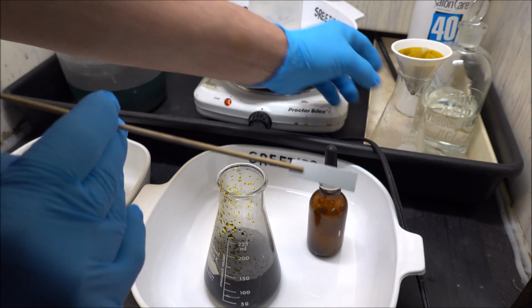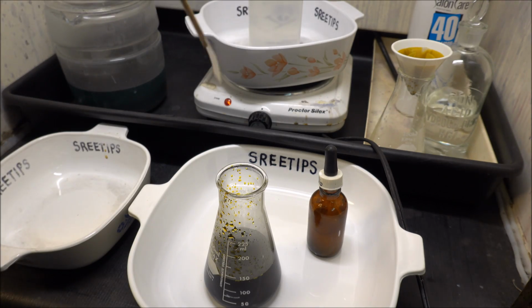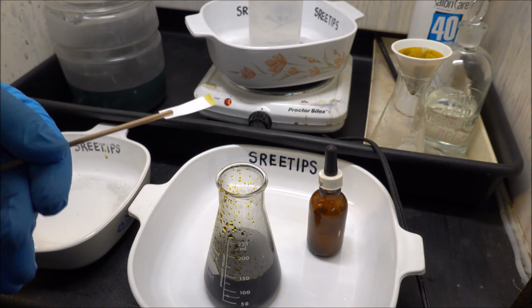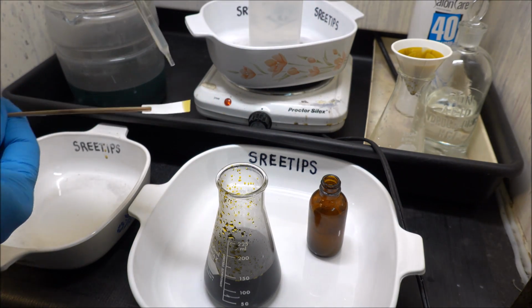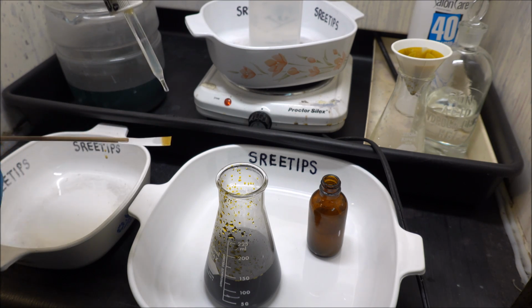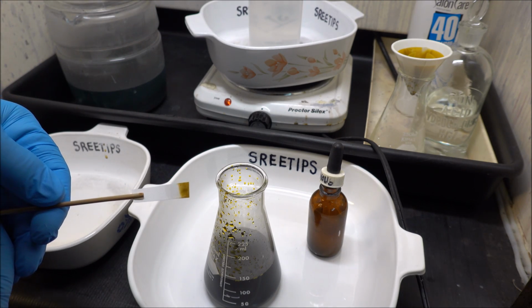And what I've got here is a piece of filter paper on the end of a bamboo skewer. Stick it down into our solution. Get a little bit of our solution on the end of the filter paper. Now I'm going to do a stannous chloride test. And you see that we've got precious metals in solution.